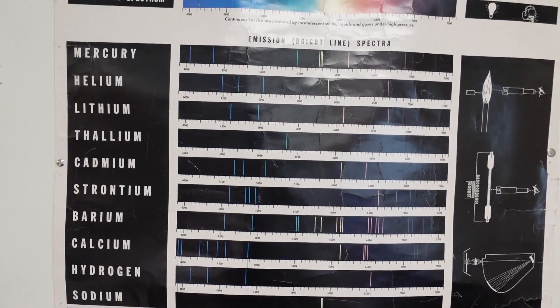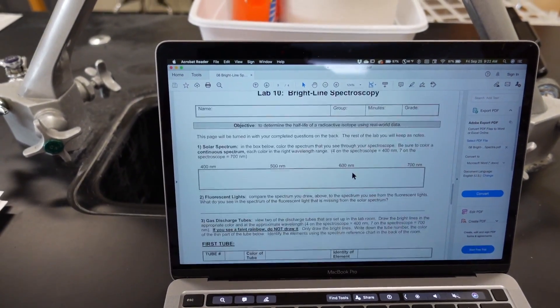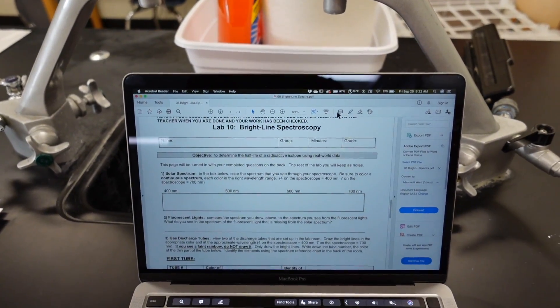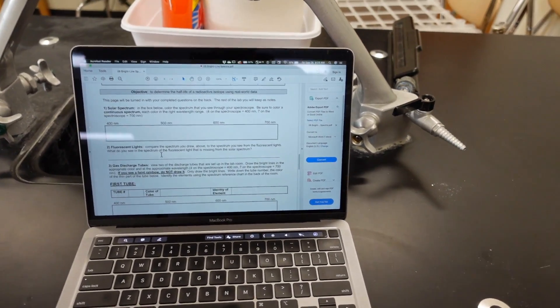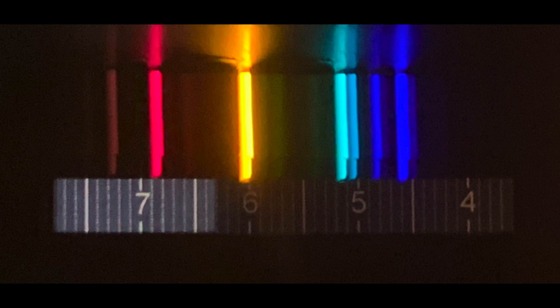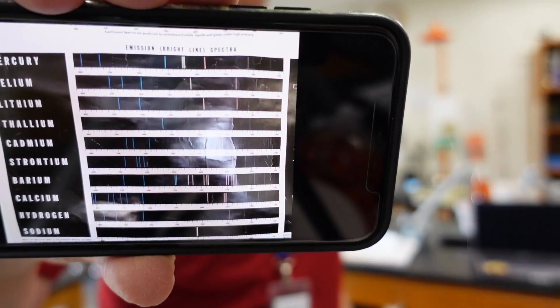I'll take a picture of this and include it so that you can use it. You're also going to get the spectrum of the sun, and for that I will actually bring you over to those windows so you can draw what the sun's spectrum looks like. Let's get the spectrum of the two elements to start. I'll put this chart up right here — use that to identify what your elements are.